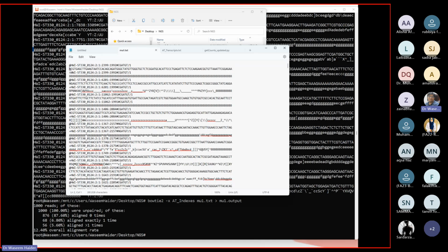So this one is the 5 prime end, and this one is the 3 prime end. For the bottom one, it will be 5 prime here, 3 prime here. So what will be the reverse complement of A? A is converted to T, and then the next A is converted to T, and G is changed to C, and then A to T, and so on. So these are the reverse complements, right?